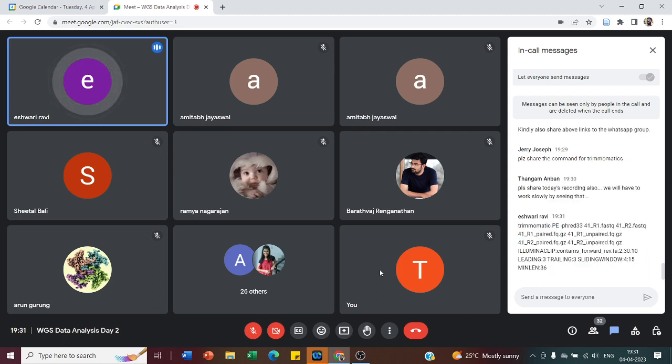So here, you can copy paste this command I have shared here in the notepad, so that you can refer to this. This is one of the standard commands for Trimmomatic, which I will explain. So here they have used Trimmomatic, and they have used PE, that is paired end, to specify that the reads are paired end. Then the Phred quality score has been given. Then read one file, read two file.